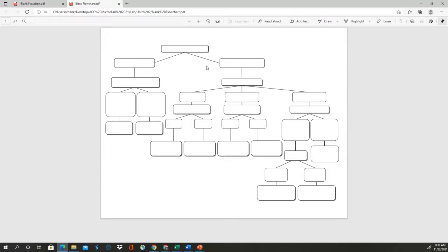And so remember, for Unit 2, we said, well, what test is going to help us ID our two different groups? For us, it was the catalase test, and that divided us into our staphylococci and our streptococci, right? And so you need to think about what test or what media you can use to differentiate the fermenters from the non-fermenters. Now, of course, this chart is not going to work exactly because we have 3 fermenters and 5 non-fermenters, but it's the same gist, right?